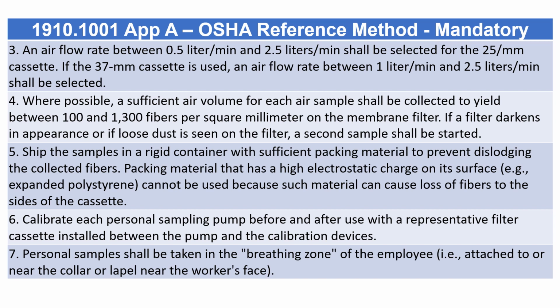6. Calibrate each personal sampling pump before and after use with a representative filter cassette installed between the pump and the calibration devices. 7. Personal samples shall be taken in the breathing zone of the employee, i.e., attached to or near the collar or lapel near the worker's face.